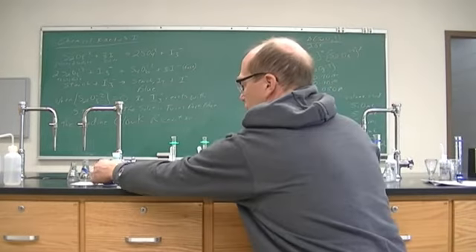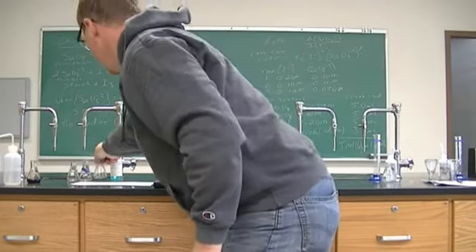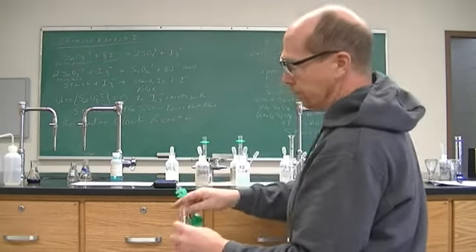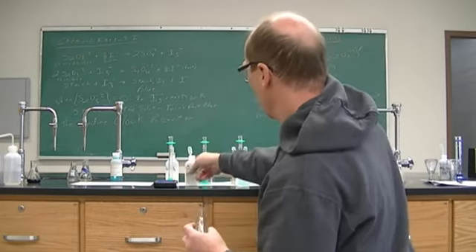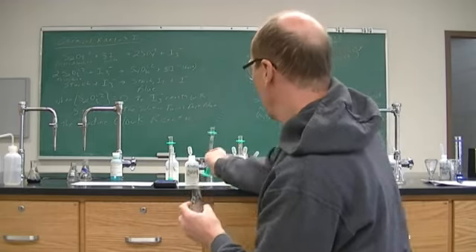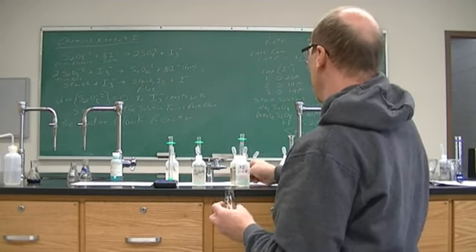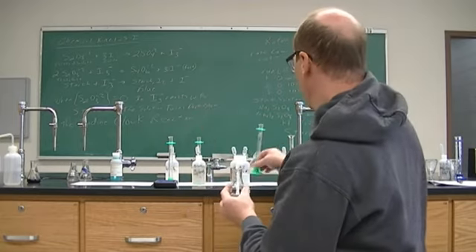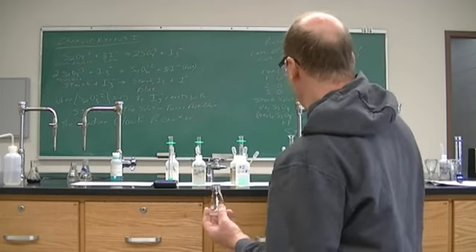All right, and now we will grab another reaction vessel. We're going to take our 3 mils of starch and our 5 mils of S2O3. Starch and S2O3 have not changed. They were the same each time. And this time we have our unknown KI, unknown number 3. Again, we're going to start this with our S2O8. We're using 0.1 molar S2O8.